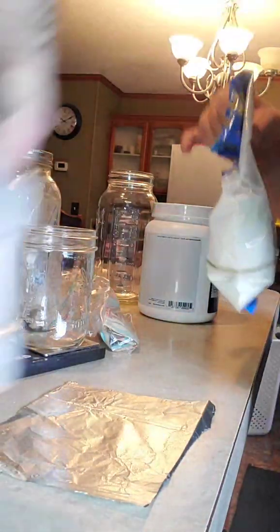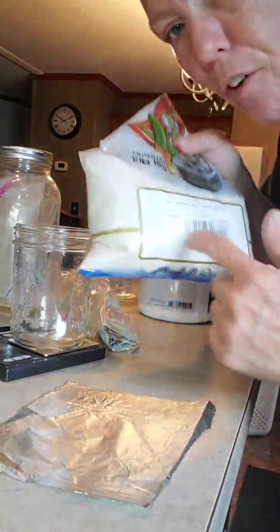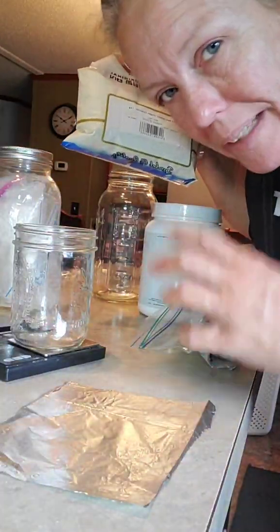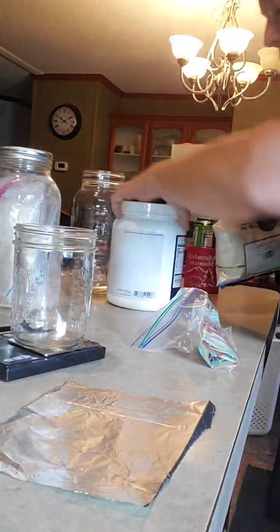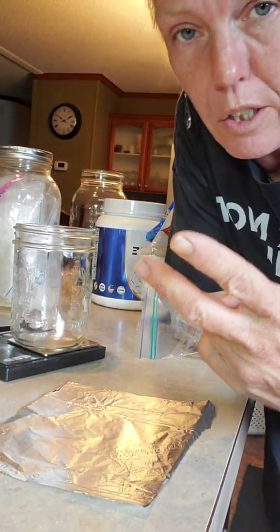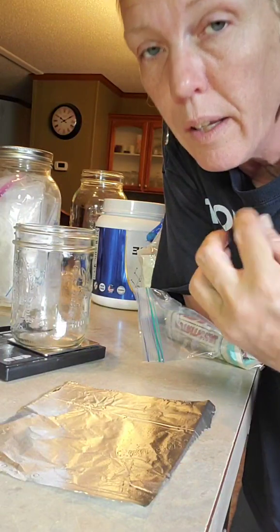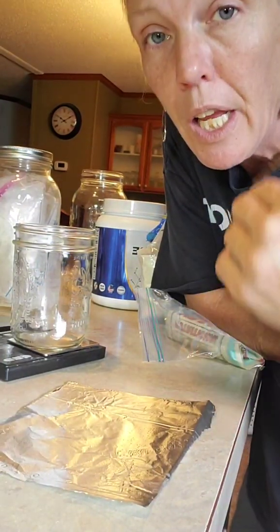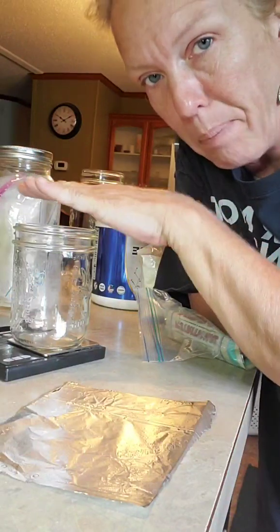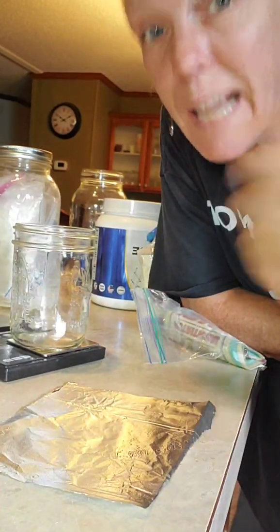So, I just wanted to show you the different types of agar. If I say agar twice, I'm referring to this. If I say agar plates, I'm referring to the entire all-encompassing thing. There are, like I said, 3 different types that are used. PDA being potato dextrose agar. Boiling potatoes, grabbing the water, filtering the water, using that water as your base, and then adding your agar, and your nutrients, your other nutrients, which is dextrose.